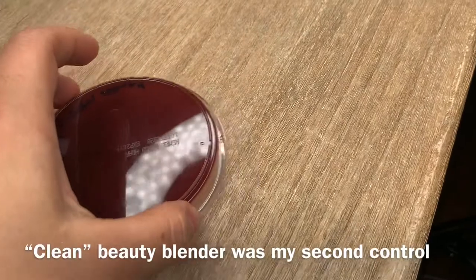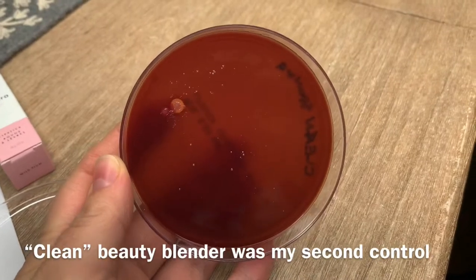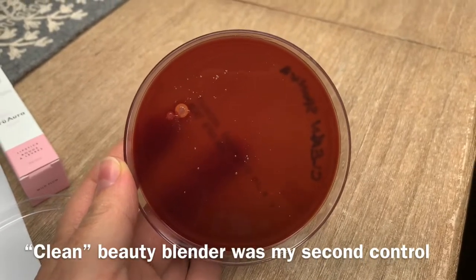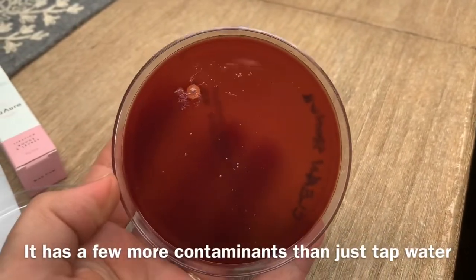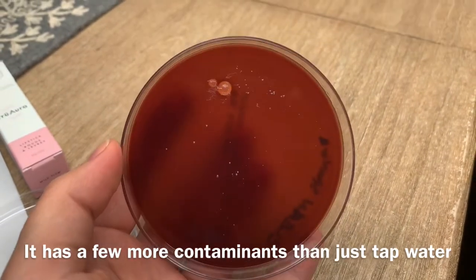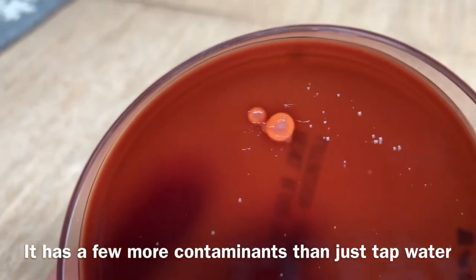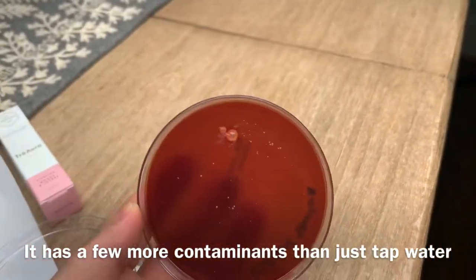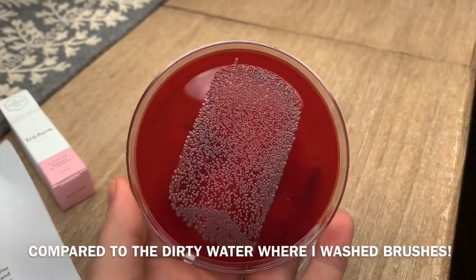Then I also took a clean sponge — it wasn't new, it was cleaned with just regular soap and water, obviously rinsed. So obviously it wasn't super clean. We do have a bunch of colonies here, and some of them are actually even hemolytic colonies that are eating sheep blood from the growth medium on the plates. It's not as bad as the plate with water from my brushes.